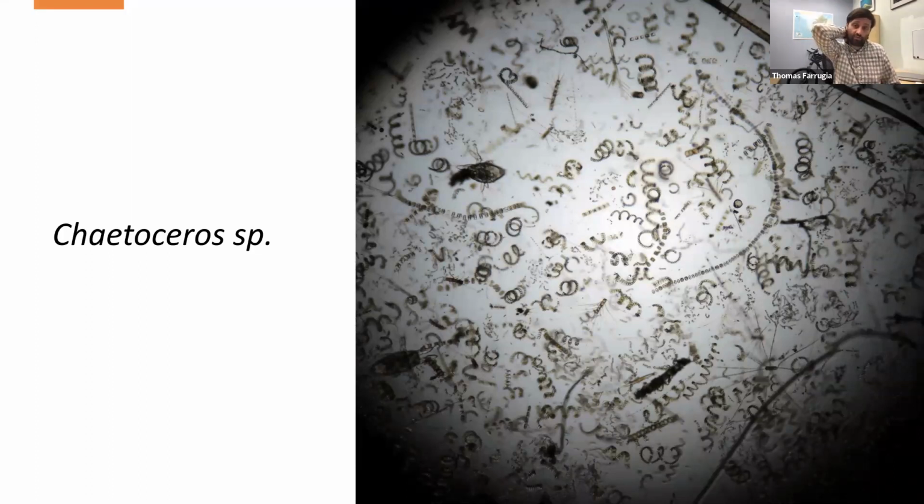So kind of going off of what Dean was saying, and also a question from the chat, can somebody touch on how we quantify the word bloom and how many cells is considered a bloom, which I'm sure will differ depending on what organism we're talking about? But it seems to be a little bit qualitative and subjective. There's just a lot of them in a sample. But is there any quantity, or is it just that if it's the dominant organism in a water sample we would call it a bloom? Who wants to jump in on that?